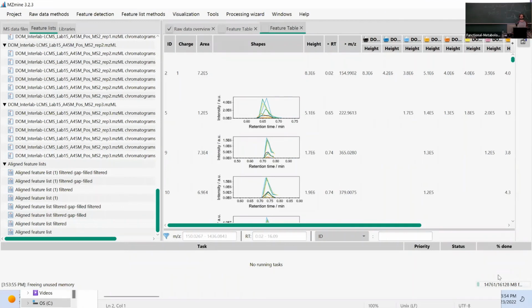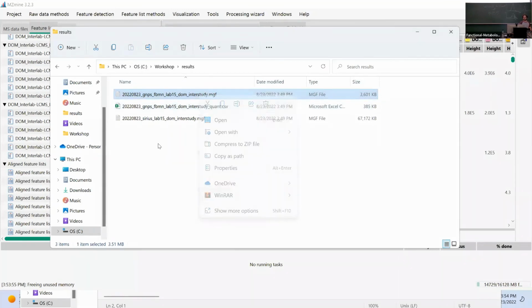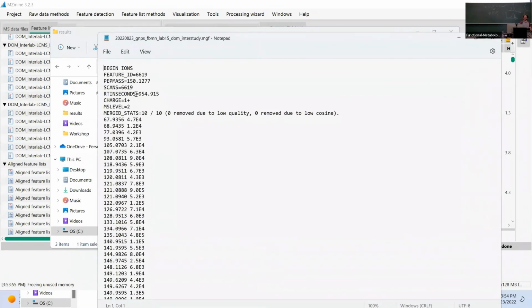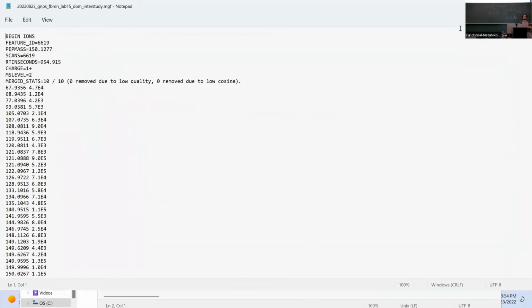Okay. So everyone should have those files now, right? Yeah. So let's see, just to show you what kind of files we now produced. I'm just opening the MGF in just any text editor. The data exchange format here is just text-based, so it's very easy to parse and also to understand by humans.